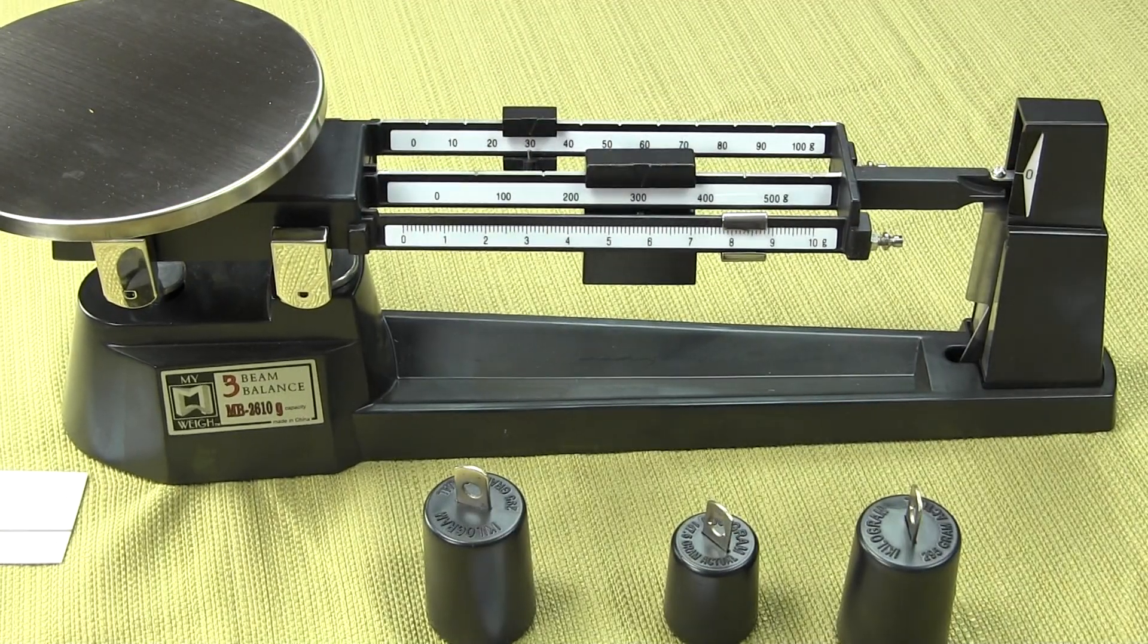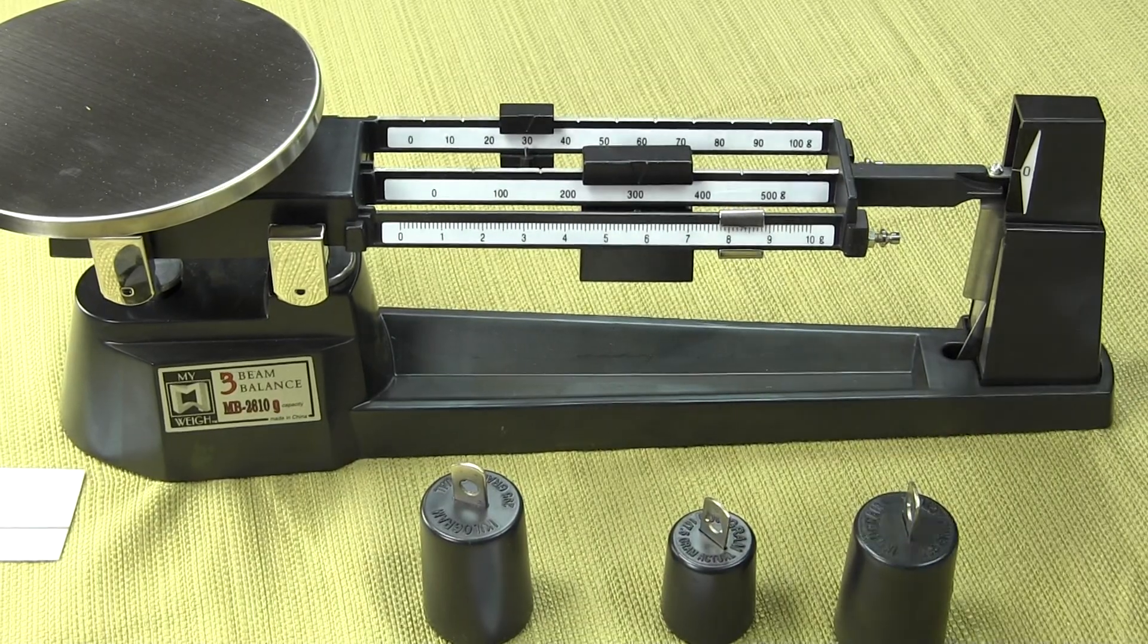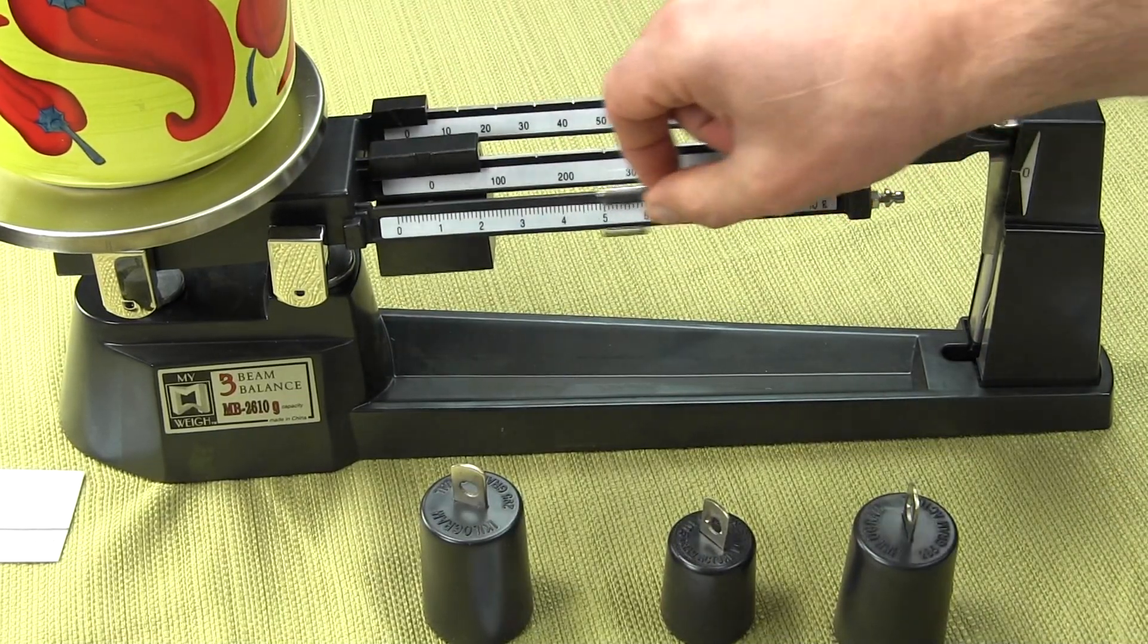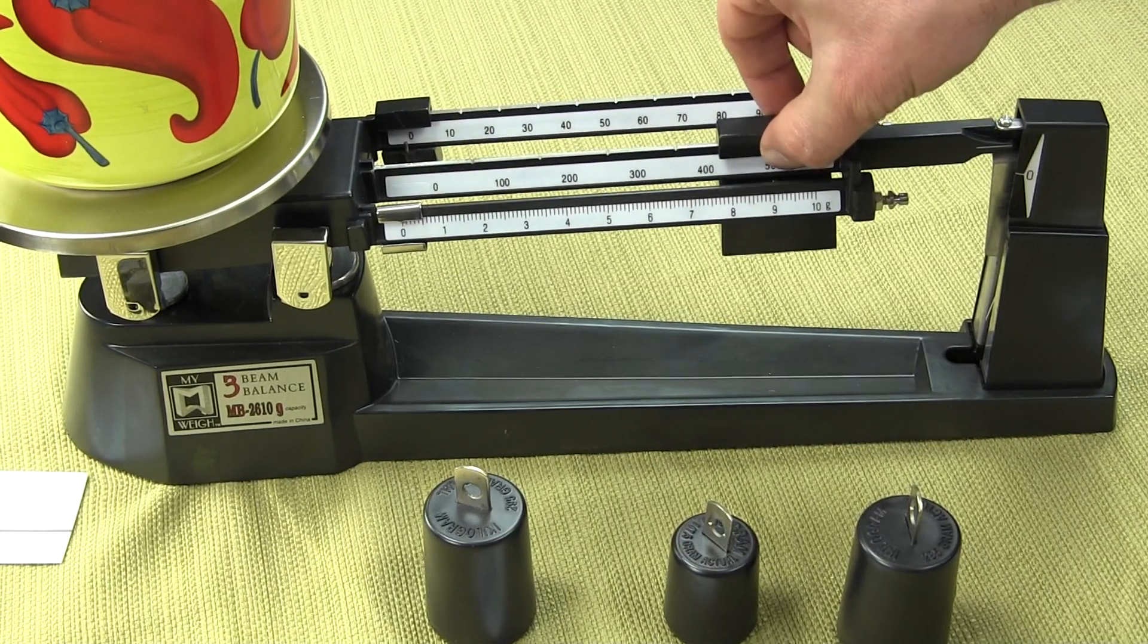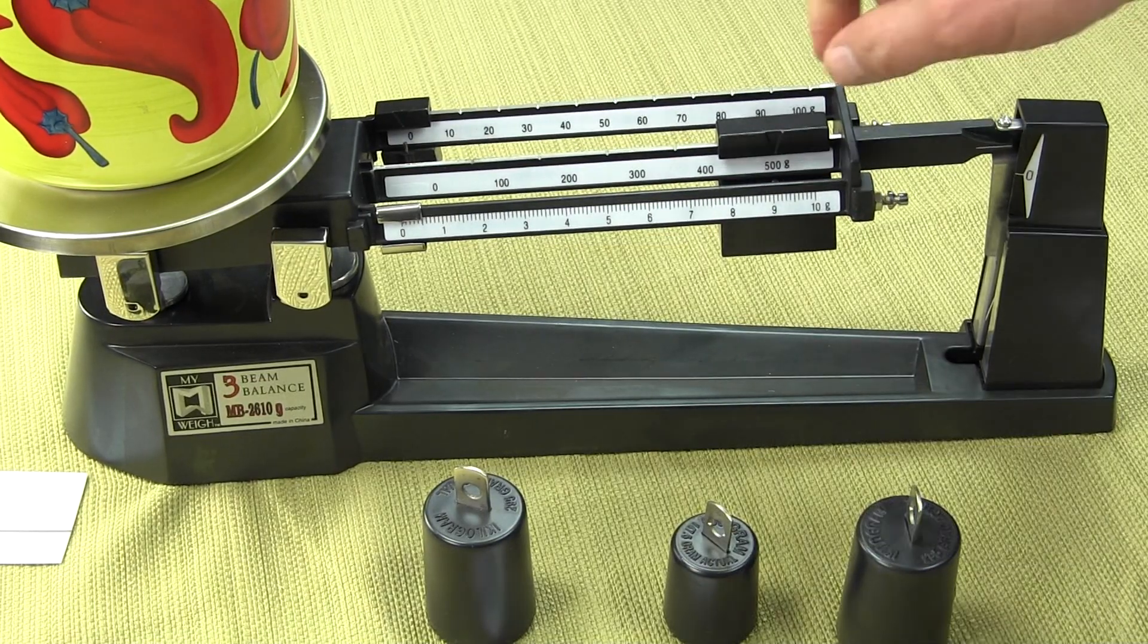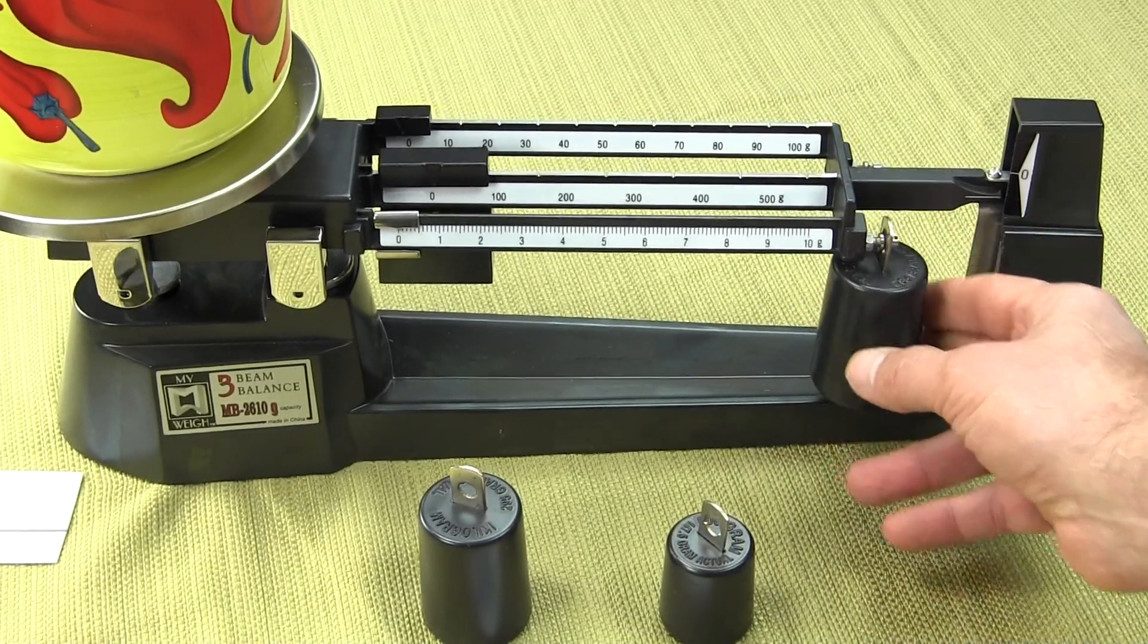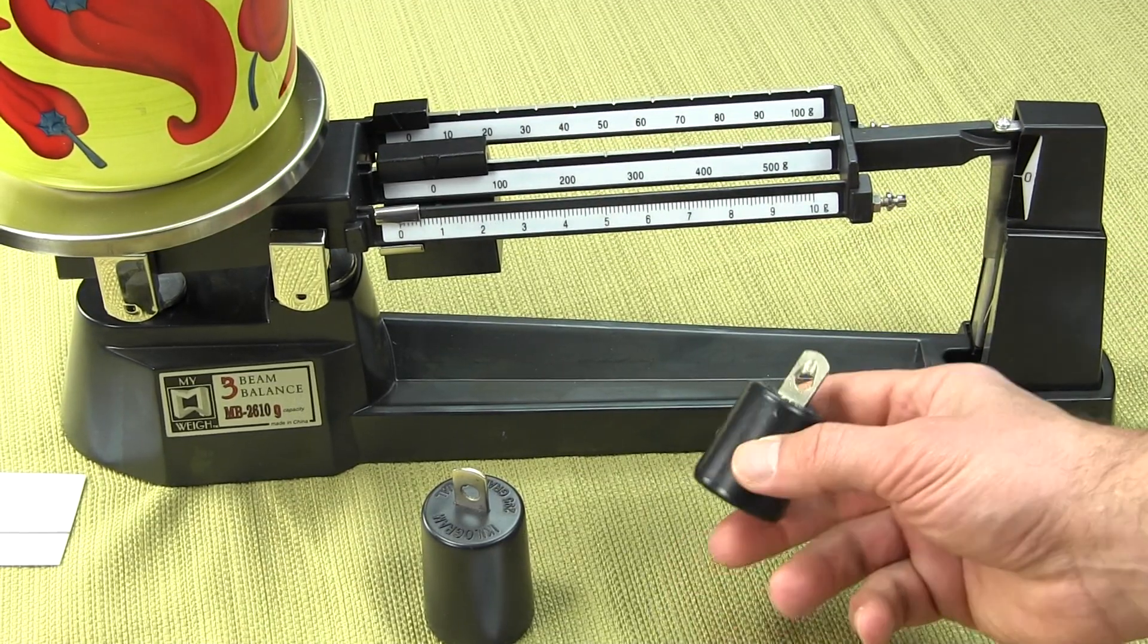We'll give you an example of how to use the attachment weights. I have a large spice container and it's the same deal. You have all your poises all the way back. You want to slide your 500-gram poise and it doesn't go down. At that point, we want to start using attachment weights. We'll put the 1,000-gram and see if the beam comes down, and it does. So 1,000 is too heavy. We'll use the 500.